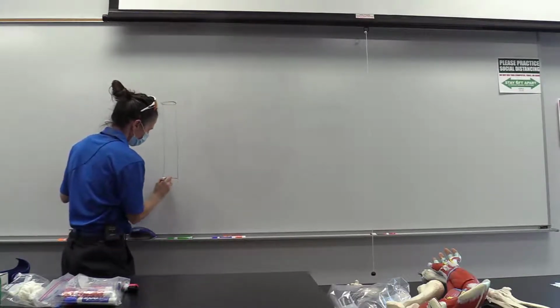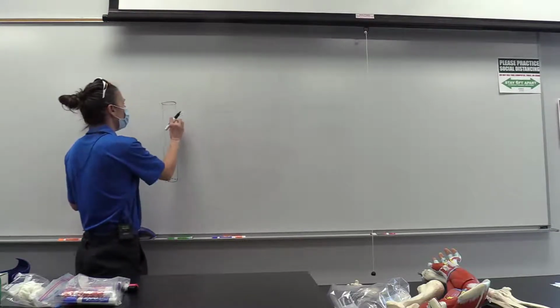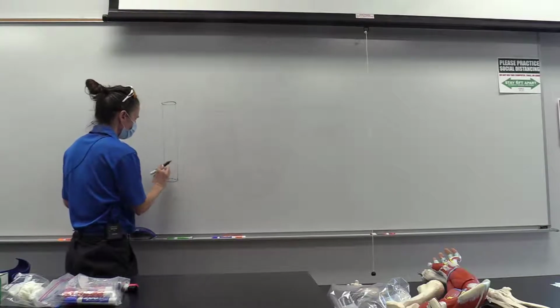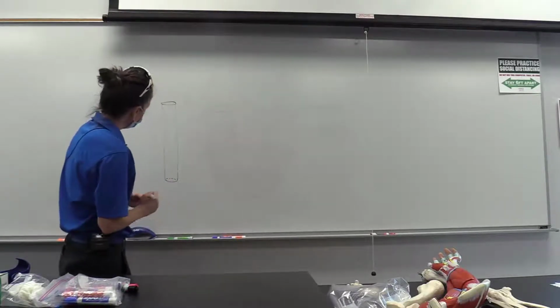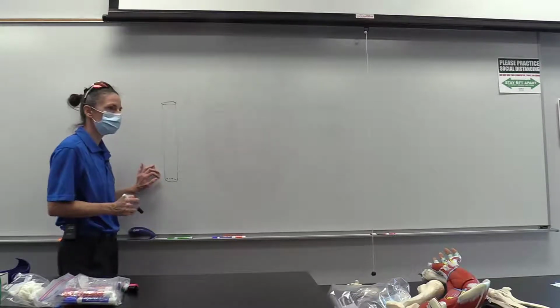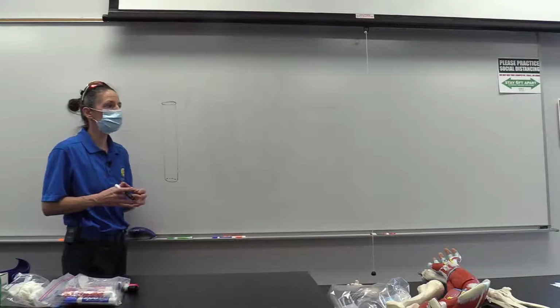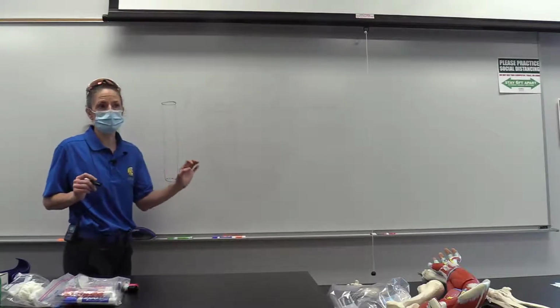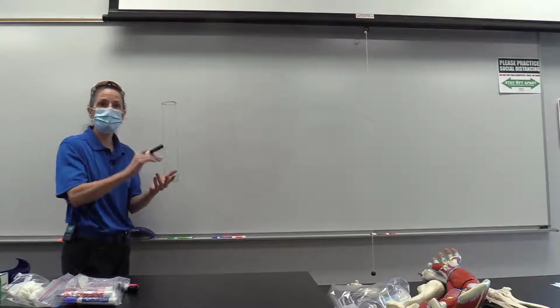Well, the thing about dialysis tubing is it has holes or pores in it of specific sizes. And that can be specified by the manufacturer. But the dialysis tubing that we chose for this experiment is big enough to let water through and certain small dyes through, but not larger molecules like you'd have in salt, starch, and sugar.